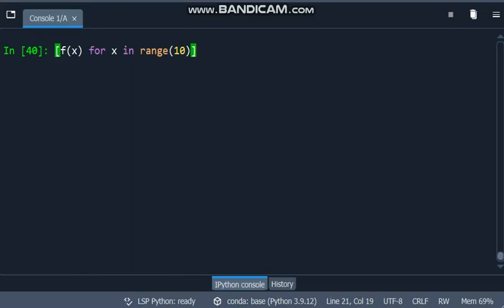In this tutorial, I'm going to show you how to use list comprehensions to specify liquid handling patterns in PyHamilton. A list comprehension looks something like this. It's a one-line expression for returning a list with a function applied to each element of a different list or other iterator.